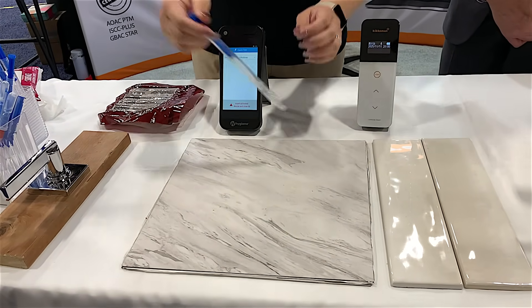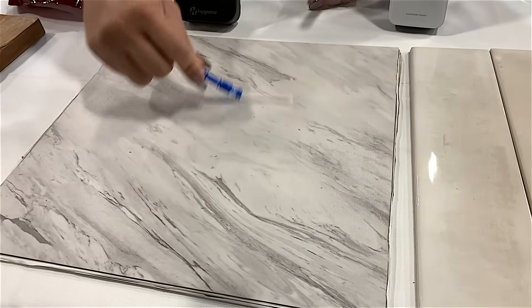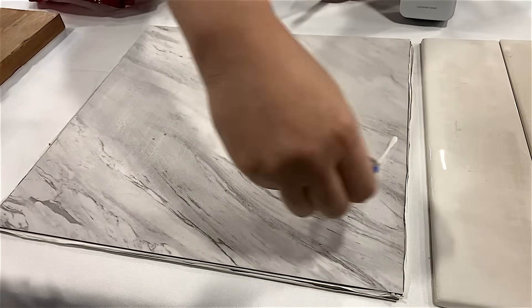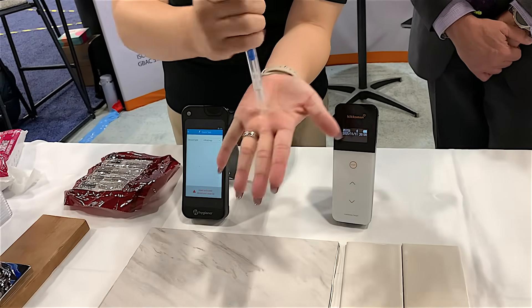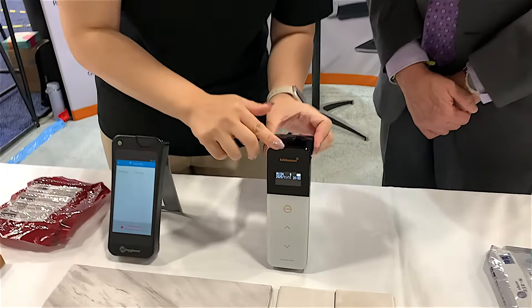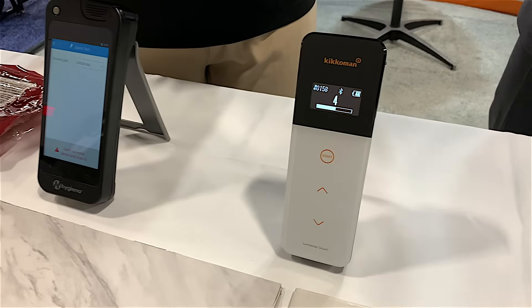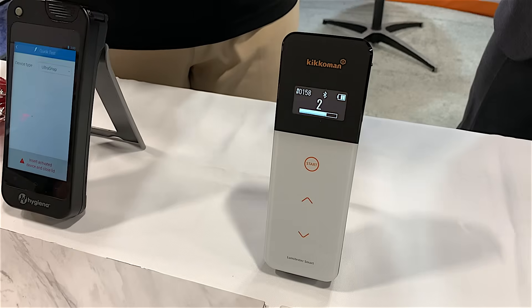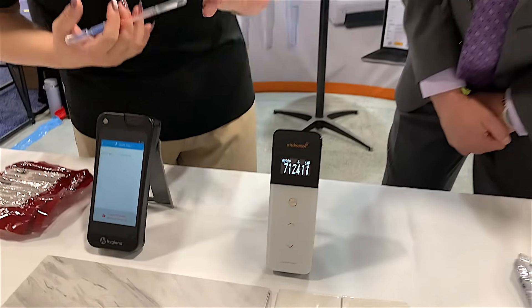I'll evenly distribute this sausage grease over the surface. First, I'll grab our LuciPac A3 surface swab. Put good enough pressure, collect the samples side by side, rotate it, push it back inside, push the swab all the way in, and mix it together. Press Start and it's going to start a countdown. So inside the machine right now, it's reading all of the luciferase that is inside the enzyme. The more dirt there is, the more light is produced, so the higher the number, the more surface contamination there is.